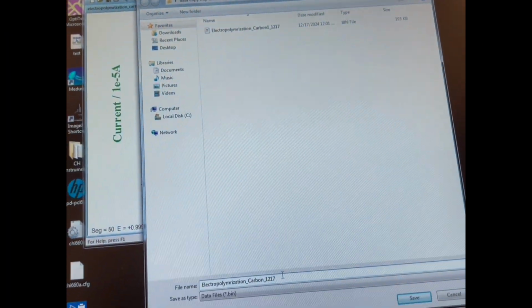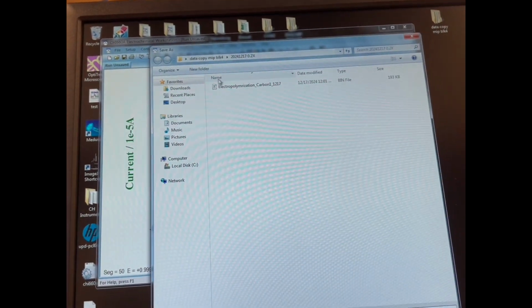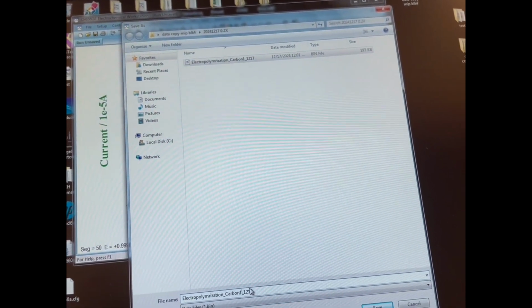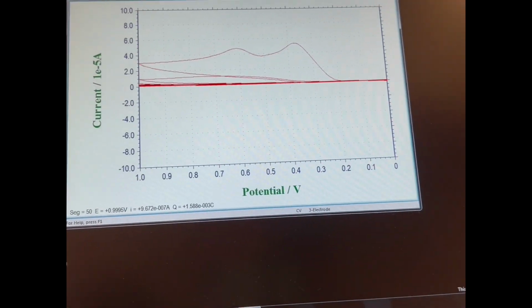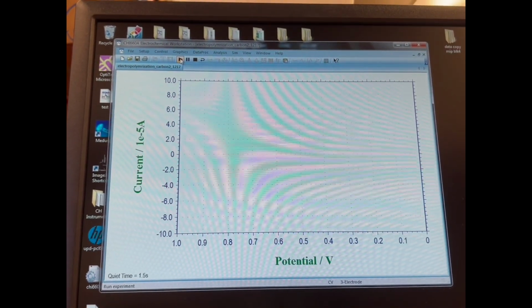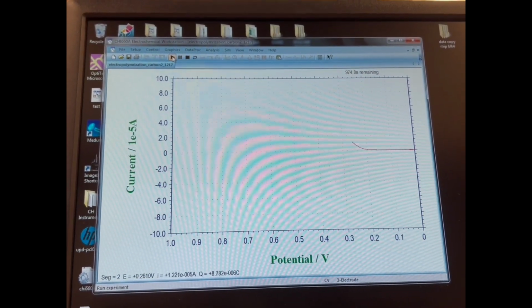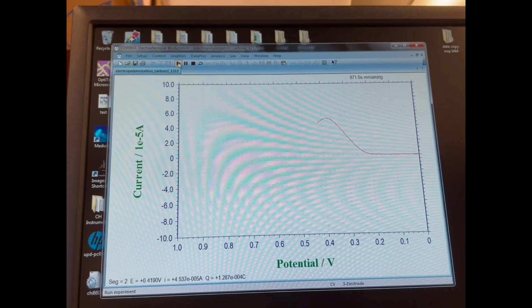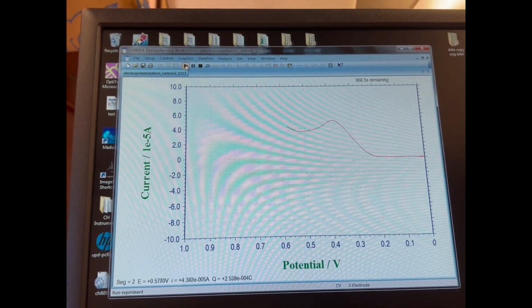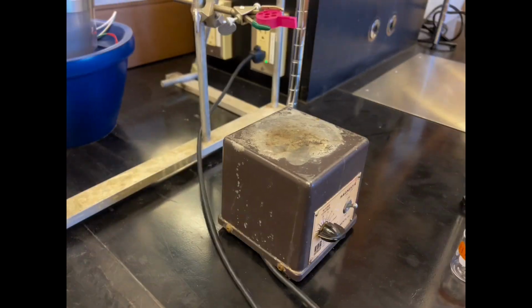Make sure we save the first CV graph. And make sure we switch the electrode. Sometimes I will forget it. And click the little black triangle to let it run. For the third electrode, we'll repeat what we did for the first and the second one. And then the next step is to do the template removal.